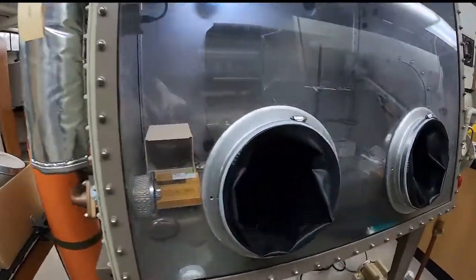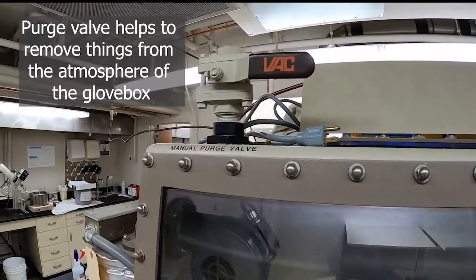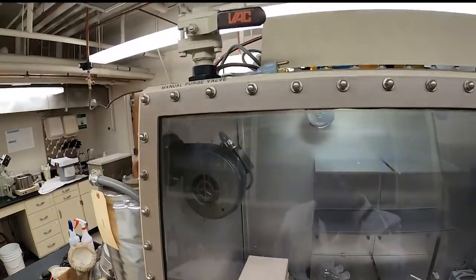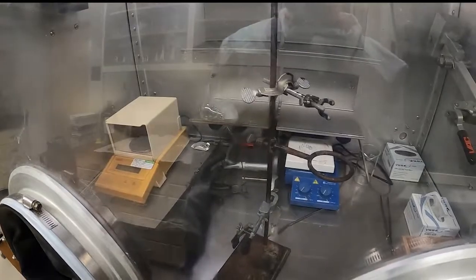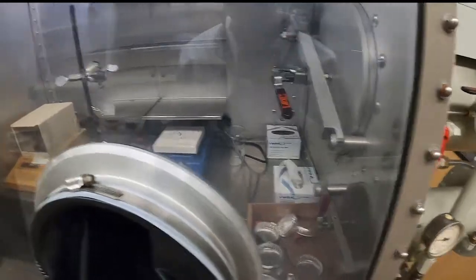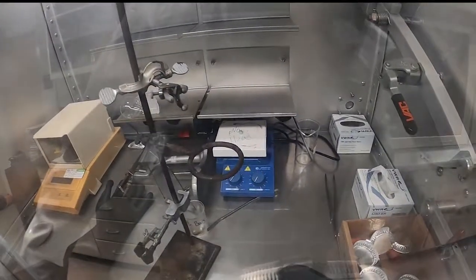The manual purge valve is so that we can remove atmosphere from the glove box and replenish it with fresh gas. If we need to, we can just open that valve and let atmosphere out while it pushes fresh inert gas in — that's important for maintaining the health of the catalyst. Inside the glove box you can also see gloves, a balance, and a stir plate.